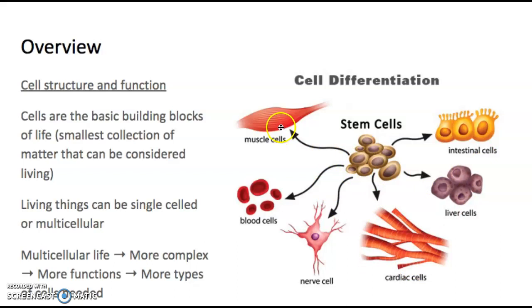There's a muscle cell which has this long sort of bubble look to it. There are red blood cells, which are really great at carrying around oxygen. There's nerve cells, which look like these really weird branching patterns. I'll show you more of those in a second. There's intestinal cells, which have little hairs on the outside, just like the ones that you saw inside of lung cells. And there's a common function between intestinal cells and some of those lung cells. They like to absorb things.